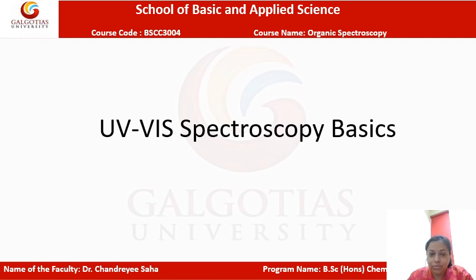So we are going to discuss UV visible spectroscopy and the basics about it. UV-Vis basically stands for ultraviolet visible spectroscopy. It is a kind of spectroscopic technique which is used for detection of organic compounds.